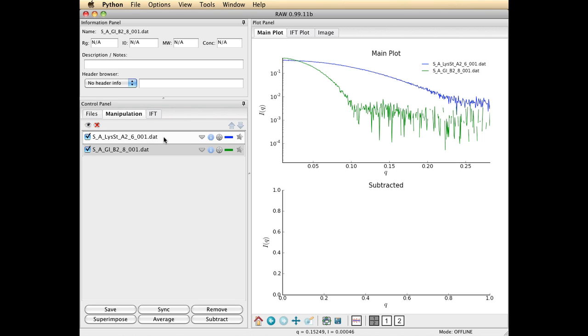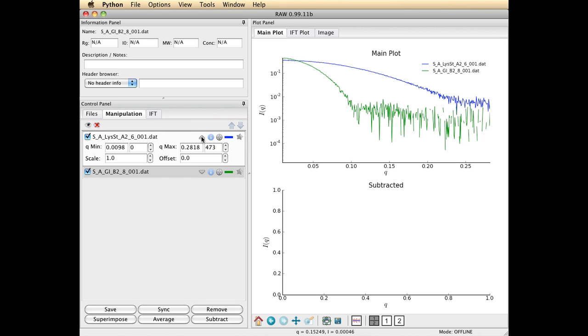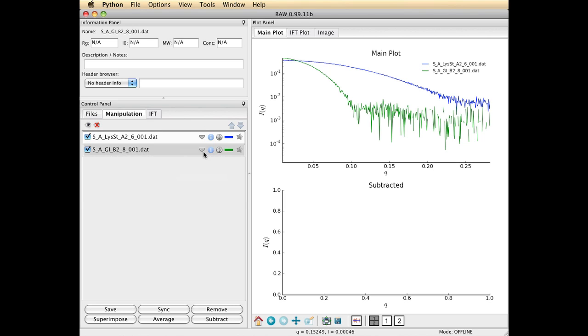You can expand and contract these little boxes using these arrows. Oftentimes when I have a large number of files on my desktop, I don't want to see all of the internal information. And I like to iconify them. And you can use these arrow tools to do that.